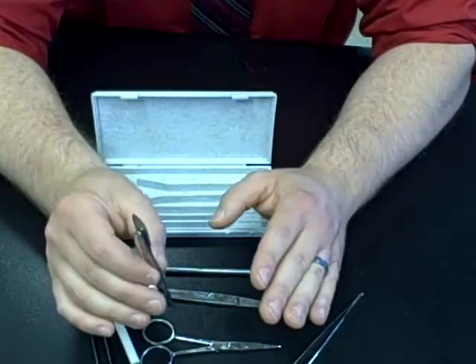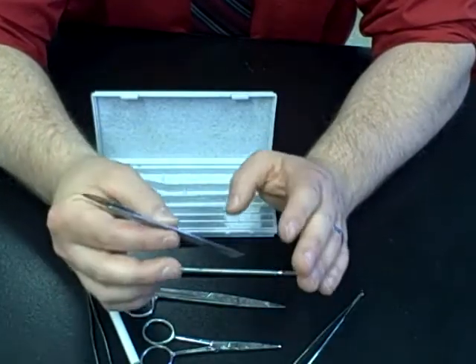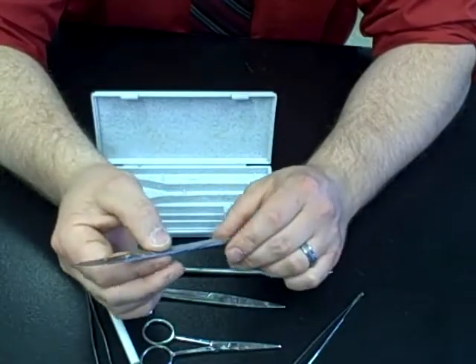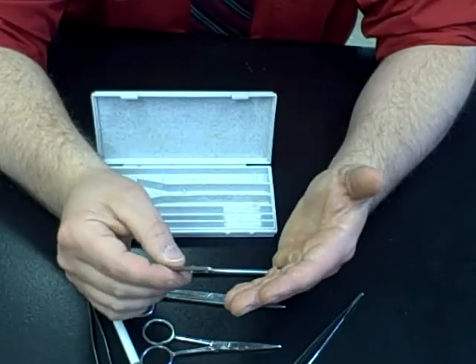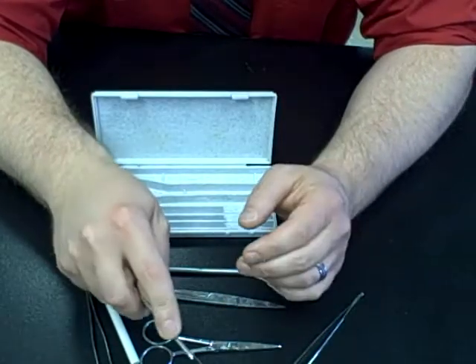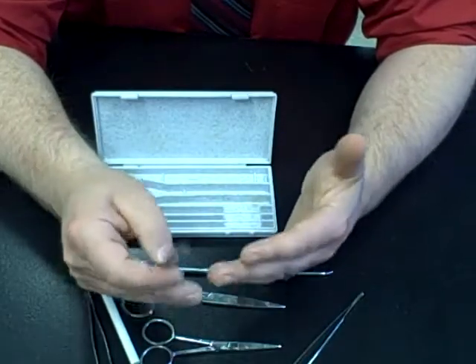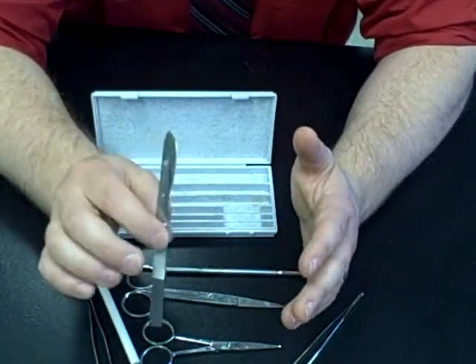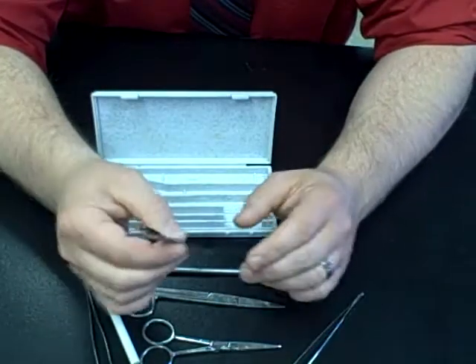I've never had anyone get hurt, but you have to be careful around this — it is extremely sharp. And honestly, it's a good thing: it's more dangerous to use a dull instrument than a sharp one. This will allow you to cut easily, but it will also cut easily through your finger just as it would through your specimens. So you need to be very careful, you need to respect the scalpel. As long as you do that, you shouldn't have any problems.